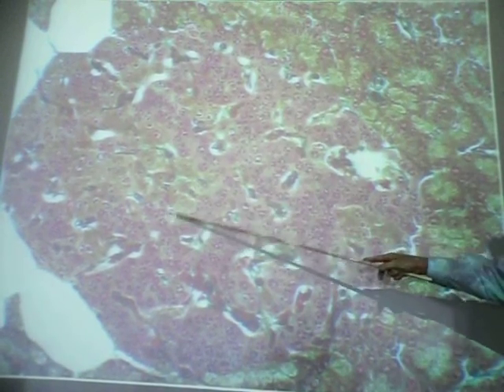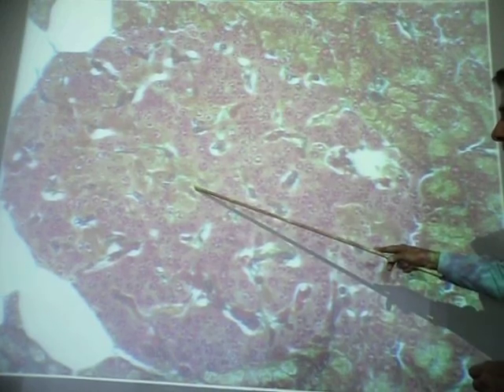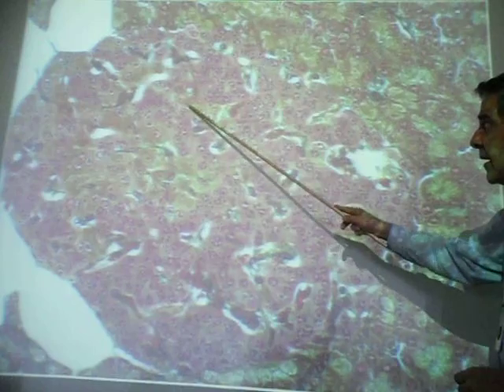The third cell type is much less abundant. These are called delta cells. The delta cells have a very light tan cytoplasm, not the nucleus, but the cytoplasm. They're not as abundant as the other two types. There's also one up here. These cells produce somatostatin, another hormone. Remember we mentioned somatostatin? Produced by cells in the gastric glands, the so-called enteroendocrine cells concentrated at the base of gastric glands.